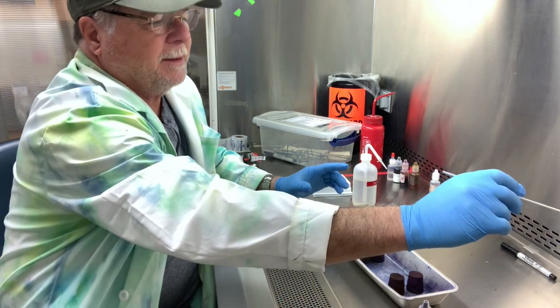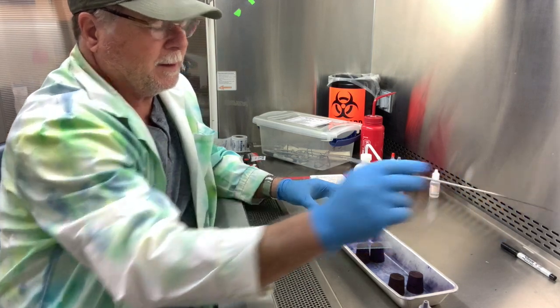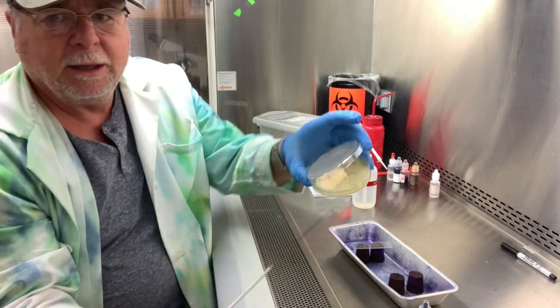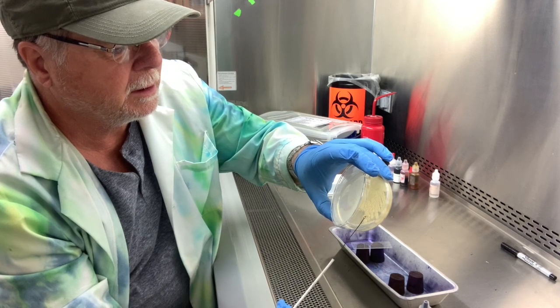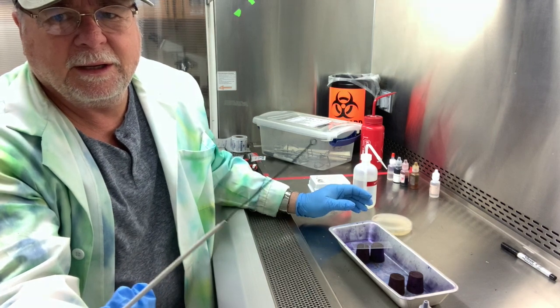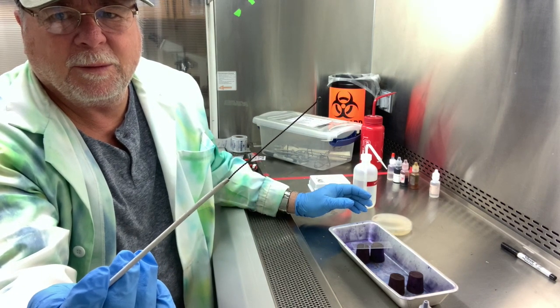All right, so because I touched my finger, I have to go in and sterilize this one more time. Let it cool, and then I'm going to go in and pick off a colony, and I'm just going to touch, and there I have it. And so you can see maybe there's a little white speck up there.